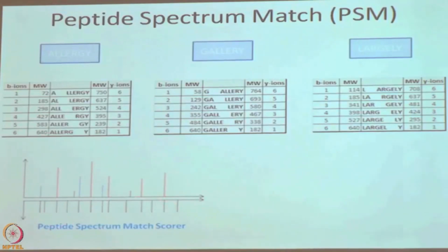This is different for different algorithms, how Mascot works, how Sequest works, how Tandem works. All these scorers differ in their way of giving a score, but however all of them will give some score. Now, it depends on us or on the method to say who has passed and who has not. So, what is the passing score here? Nobody knows, and in fact that can be a debate.